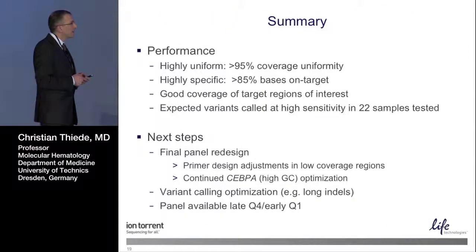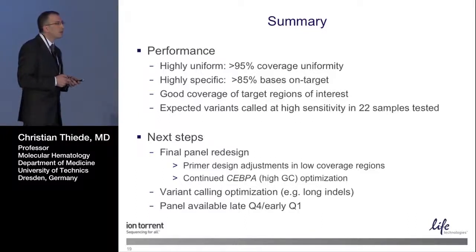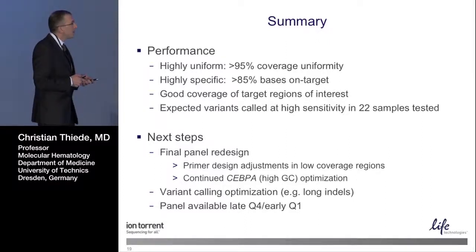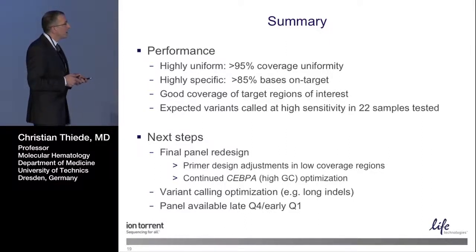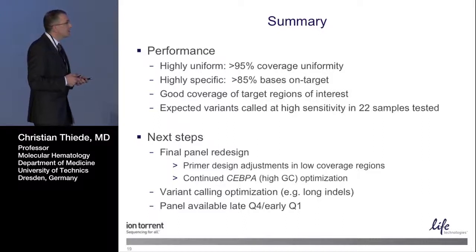So in summary, even though this was only a very first shot, the results are already quite convincing and quite encouraging. We have a very good and uniform coverage and a high specificity with reads on target. The coverage is totally sufficient and can even be decreased.